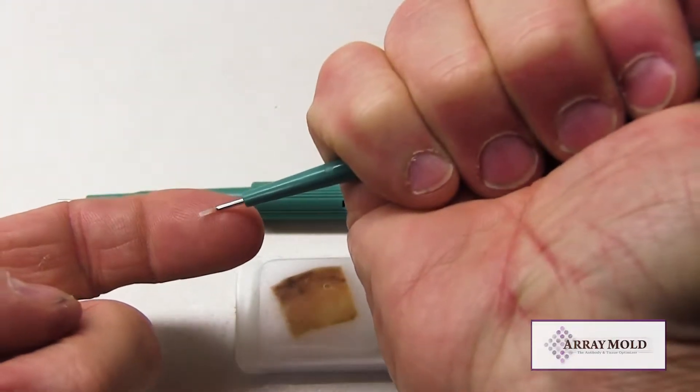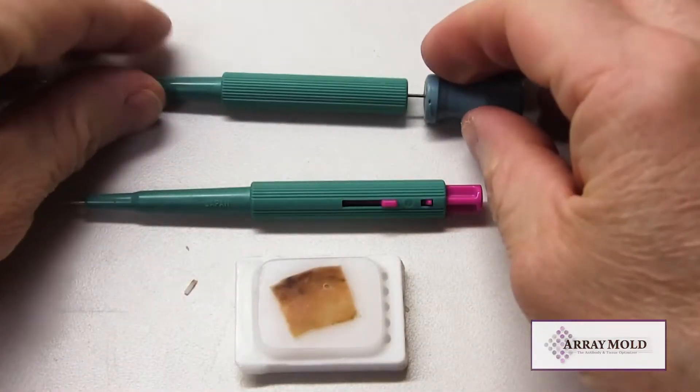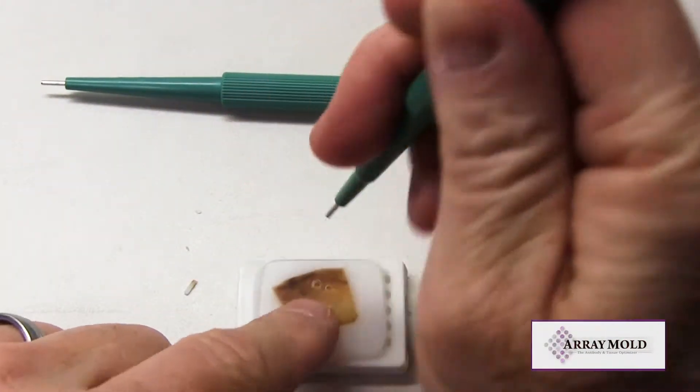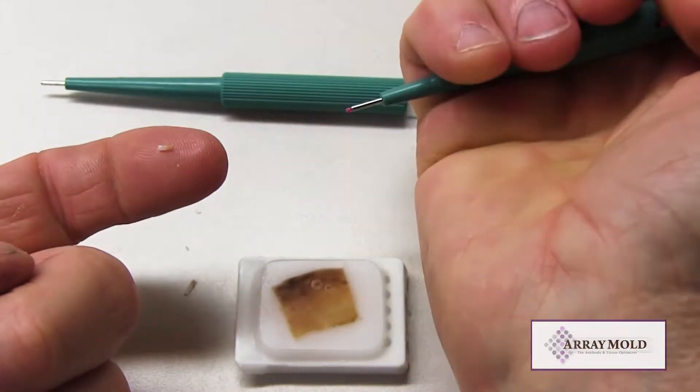First we are using the needle with the stylet, or the needle without the plunger. Now we are using the needle with the plunger. As you can see, both needles function basically the same.